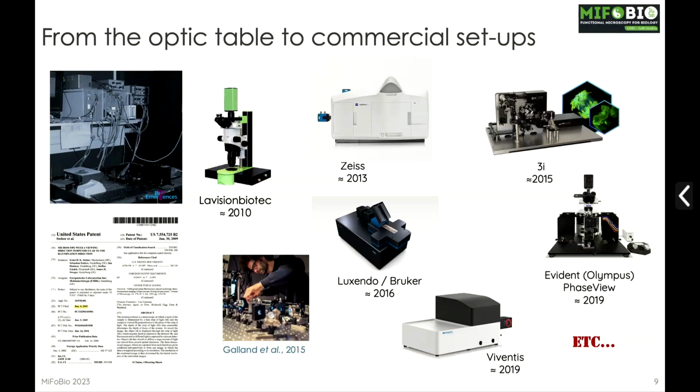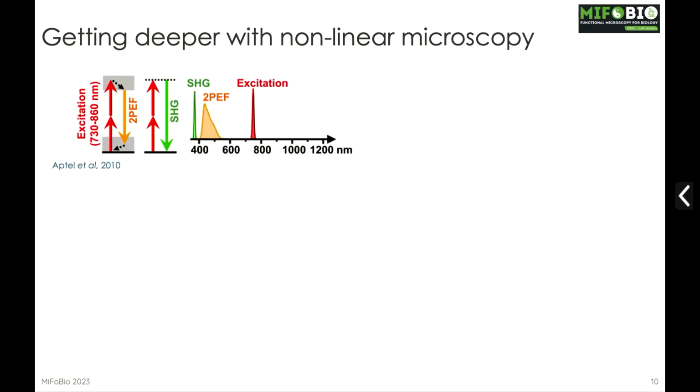And here I also wanted to show you Rémi Galland at work aligning lasers, and with Jean-Baptiste they were building the SOSPIM that you may have heard about as well.